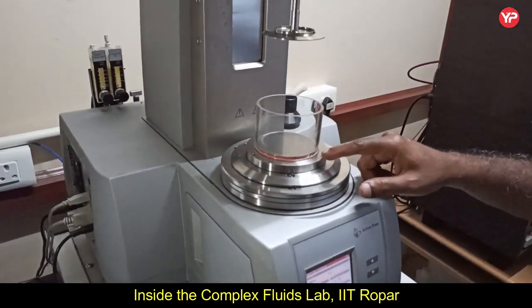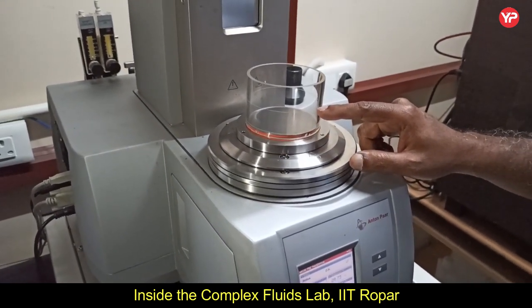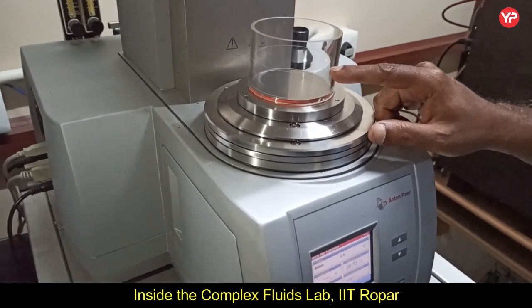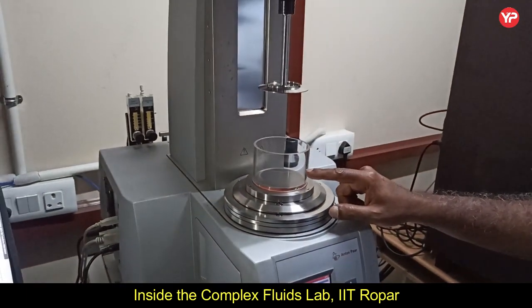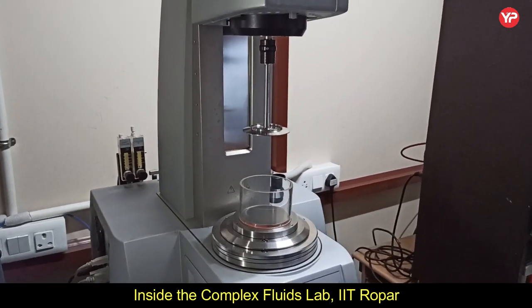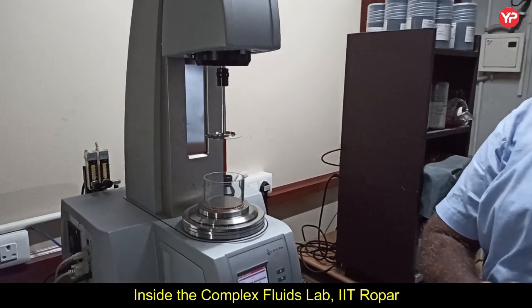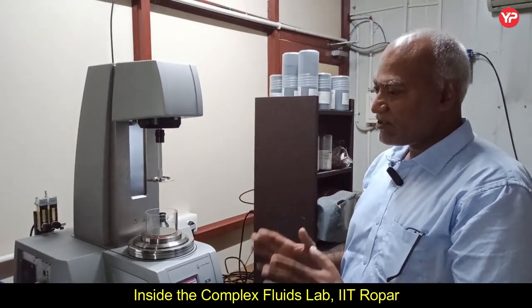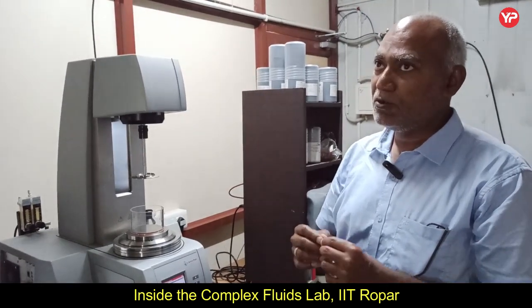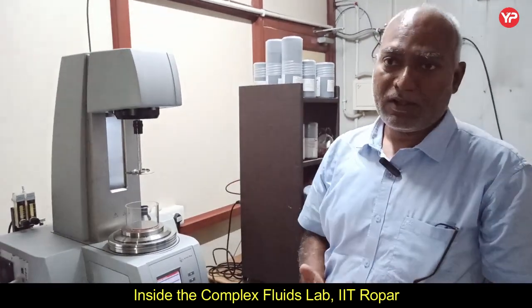In this interfacial rheology, we fill up to this line some fluid, and after that a different fluid, and this upper plate goes up to this line, and then we study the rheology of the interface. So this equipment is so sophisticated that it can give you the rheology of the interface also.